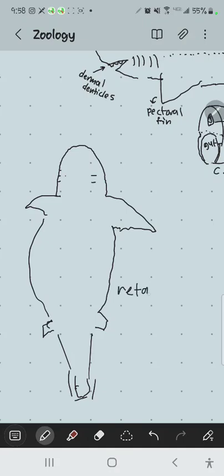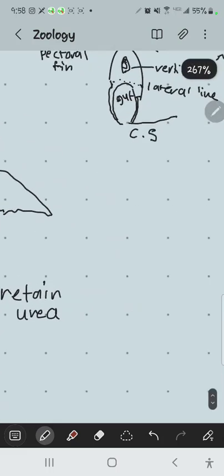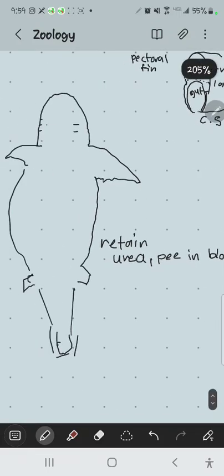So if you've ever eaten shark, it kind of tastes a little tangy. It's urea, so they basically taste kind of like urea. So all the tissues are bathed in urea in order to make them isoosmotic. But they do have a separate osmoregulatory organ, which I'll point out on their digestive tract.